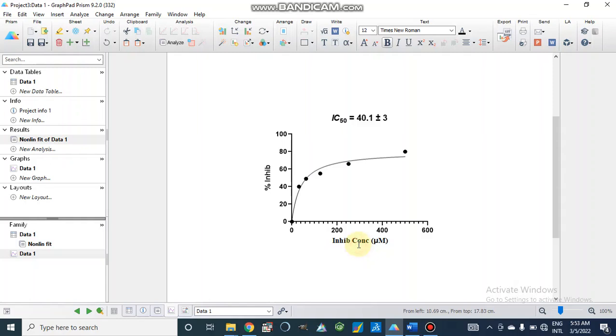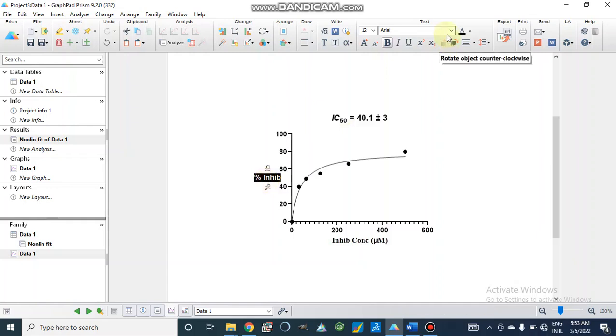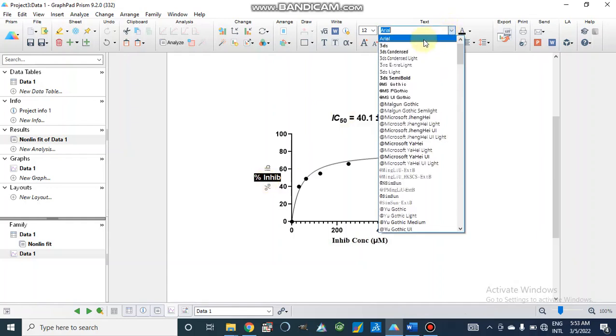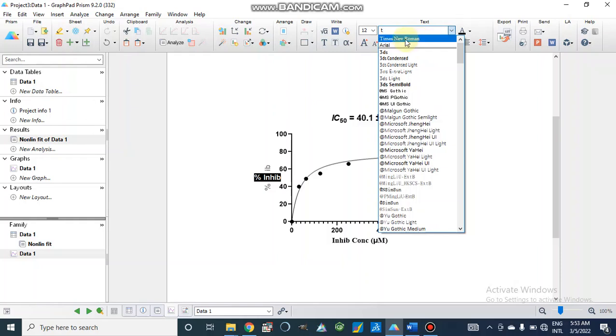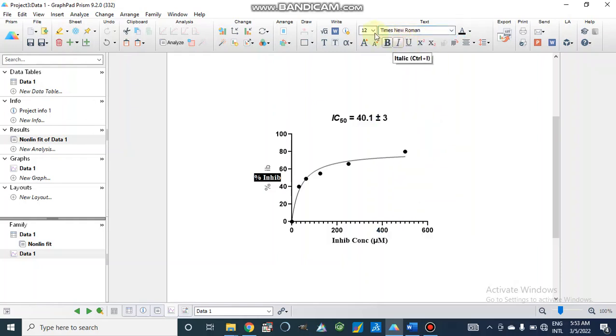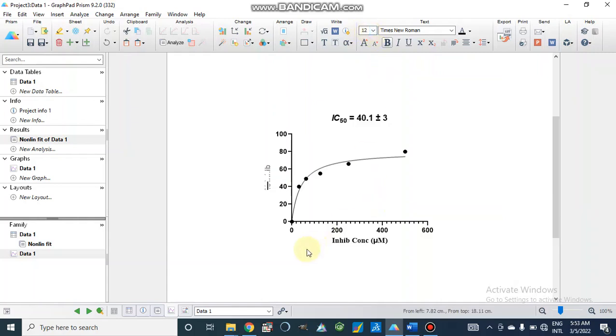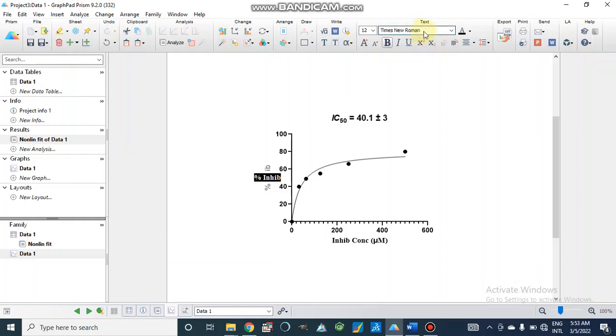We can change the color. This is in Times New Roman, we can also make it different. We can select font size from here. This is our inhibitor and center.